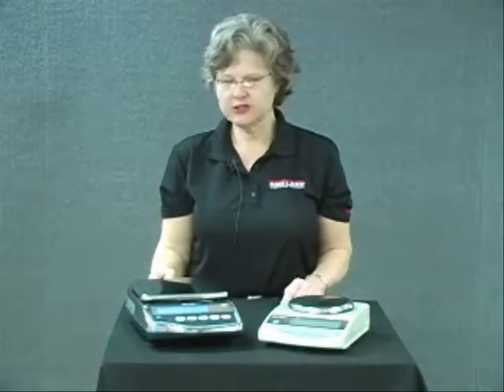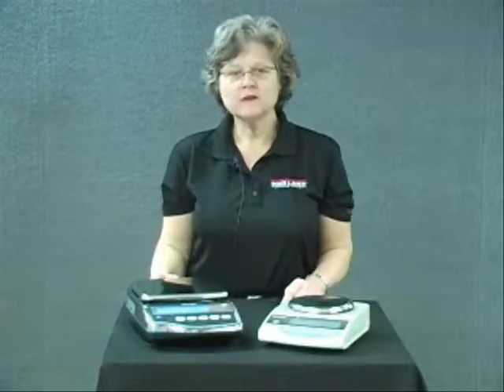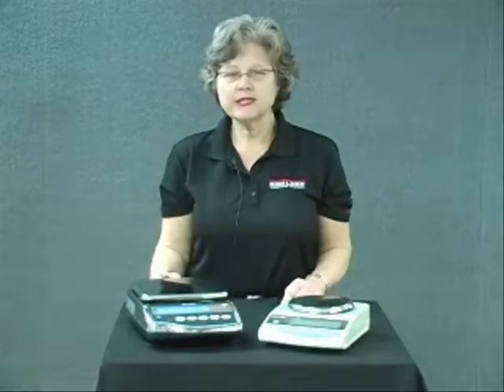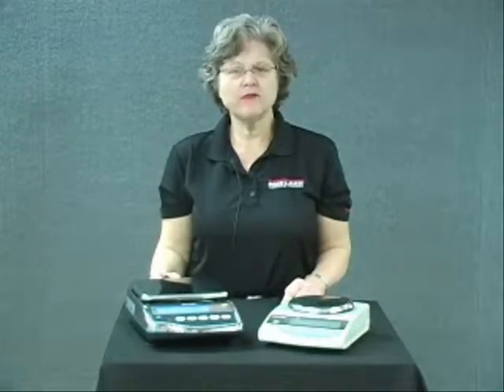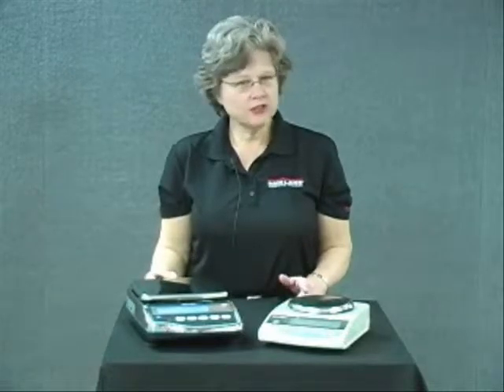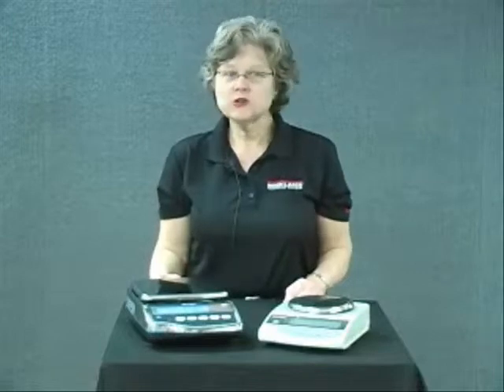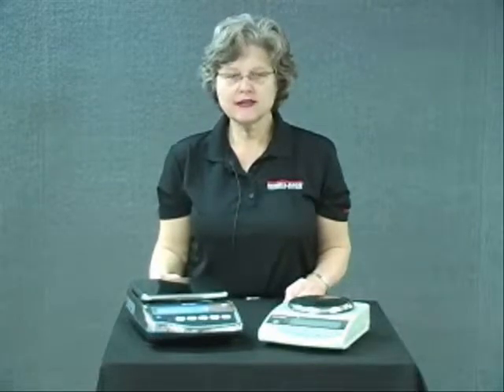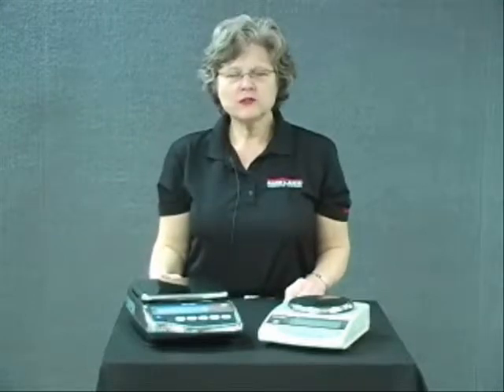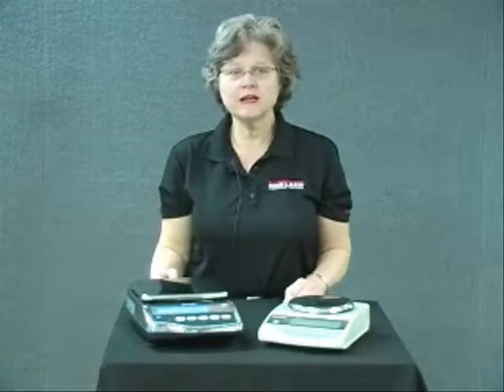The Rice Lake Balance Technology. We're excited to present our new balance line which is standardized on tuning fork technology. This is an extension from an existing balance series that we carried before. This technology is not new to the industry. There are three major force measuring systems used today: load cells, electromagnetic, and tuning fork sensor. The tuning fork technology excels because of excellent performance and it's very reliable and stable.